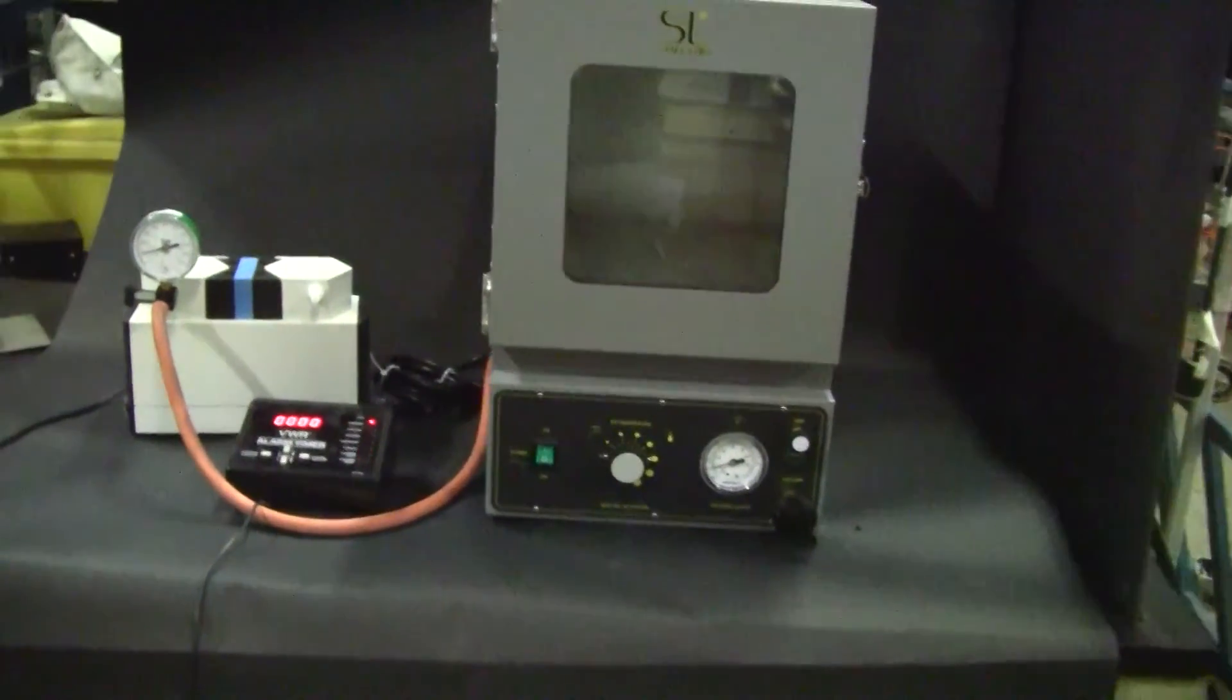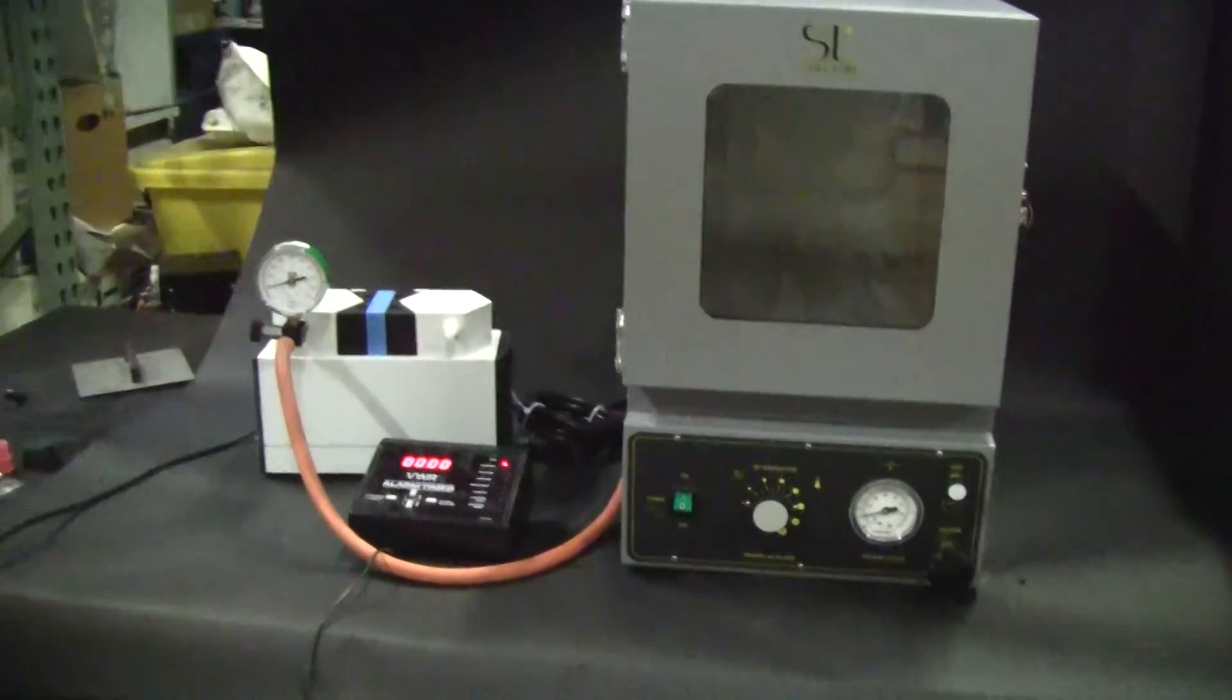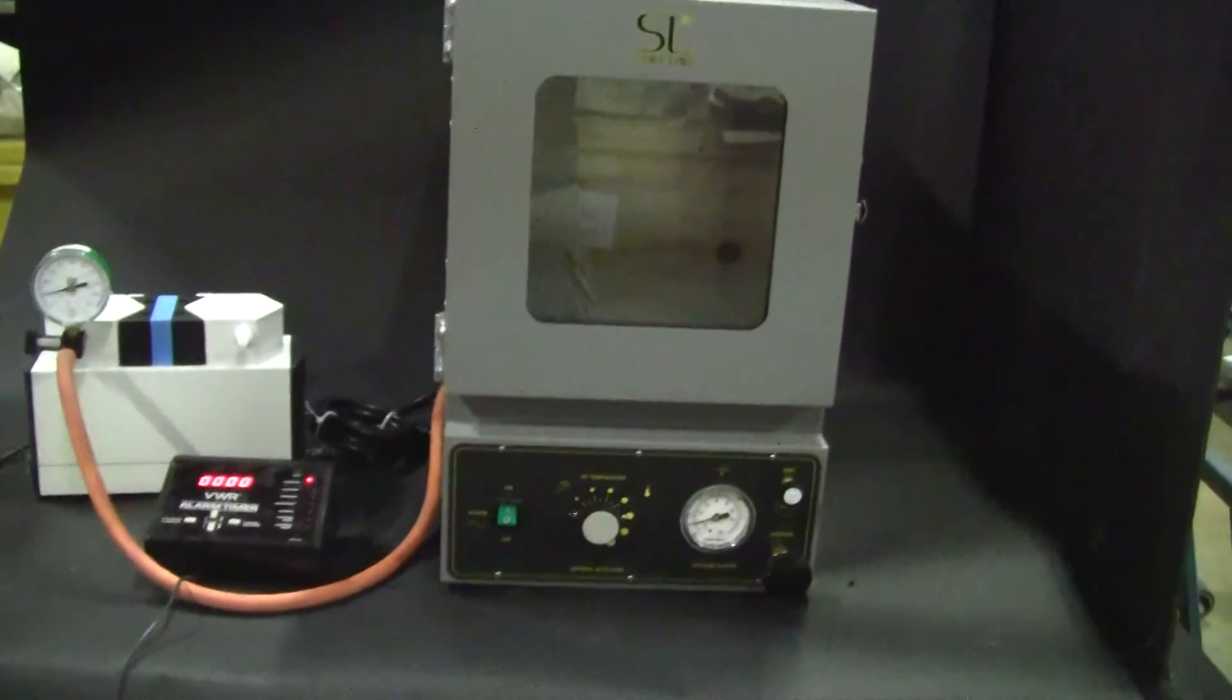Hi, this is Michael from HitechTrader. Today we're looking at a Shell Labs vacuum oven. This is a brand new vacuum oven.